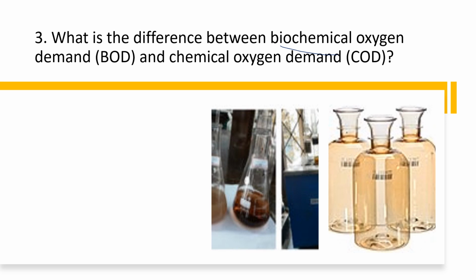The second and most important difference is that BOD takes about 5 days to complete, and the COD experiment can be completed within 2 to 3 hours. 2 hours of digestion, and if you take about half an hour to 1 hour for analysis, maximum it takes about 3 hours to complete.